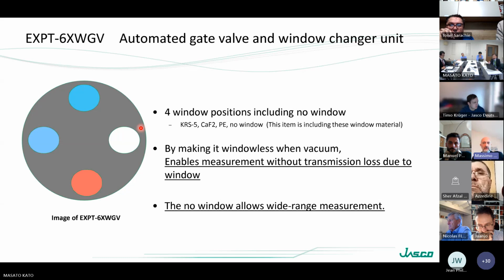It's not a question. I just want to point out some needs of our colleagues that are selling FTIR in Europe and in the Middle East. We usually receive requests for full vacuum FTIR, especially for measurement of semiconductor lasers, for black body furnace experiments, or FTIR that is able to work in the far IR region by using a bolometer. I know that we can go up to 20 wave number.